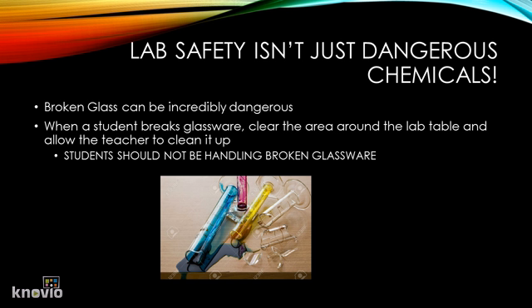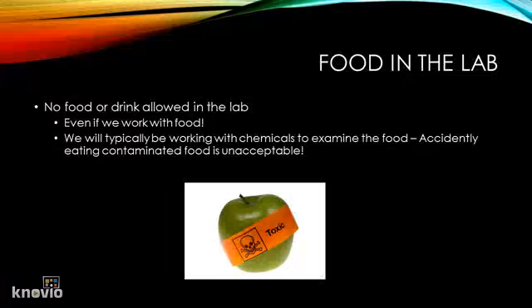Students should never in any situation be handling that broken glassware. That should be something that the teacher does. They clear the area, have students move away while they sweep it up, and then once the teacher determines that it's a safe location, once they determine that the lab area is safe, students can return to their lab.